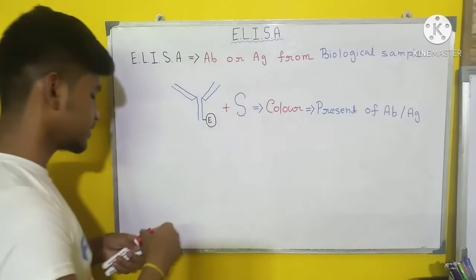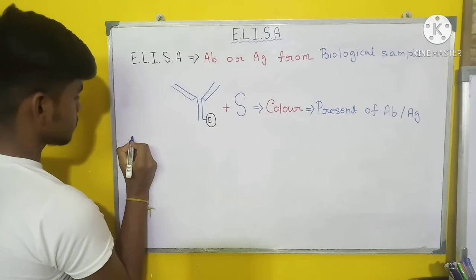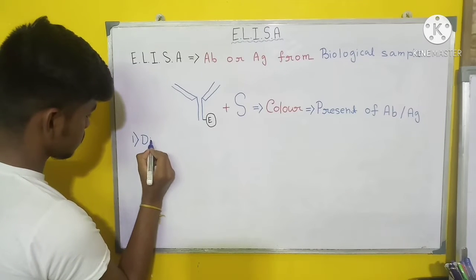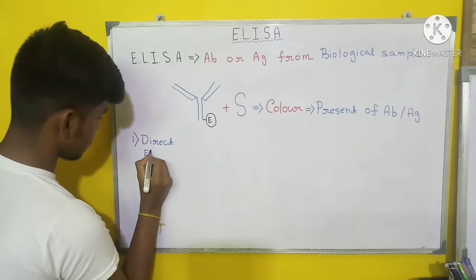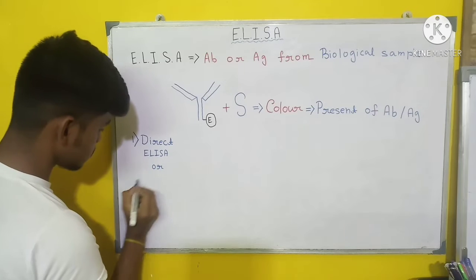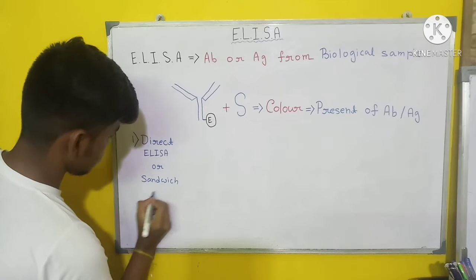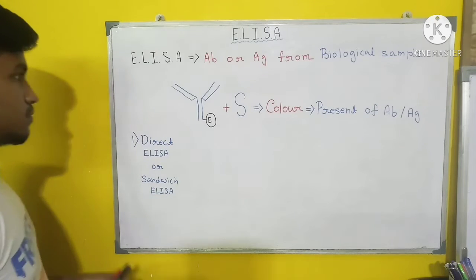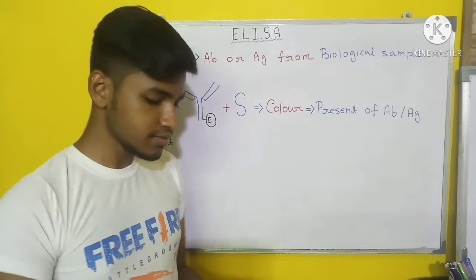One type is direct ELISA or sandwich ELISA.